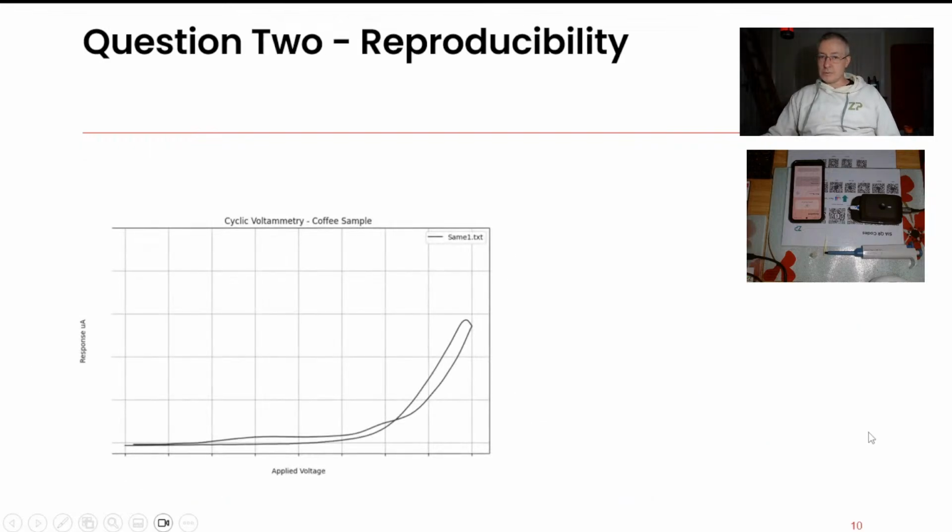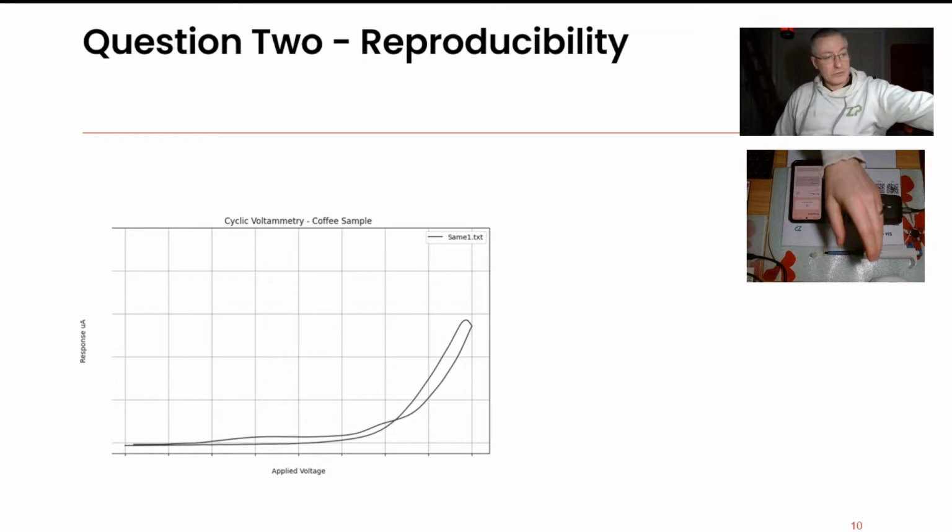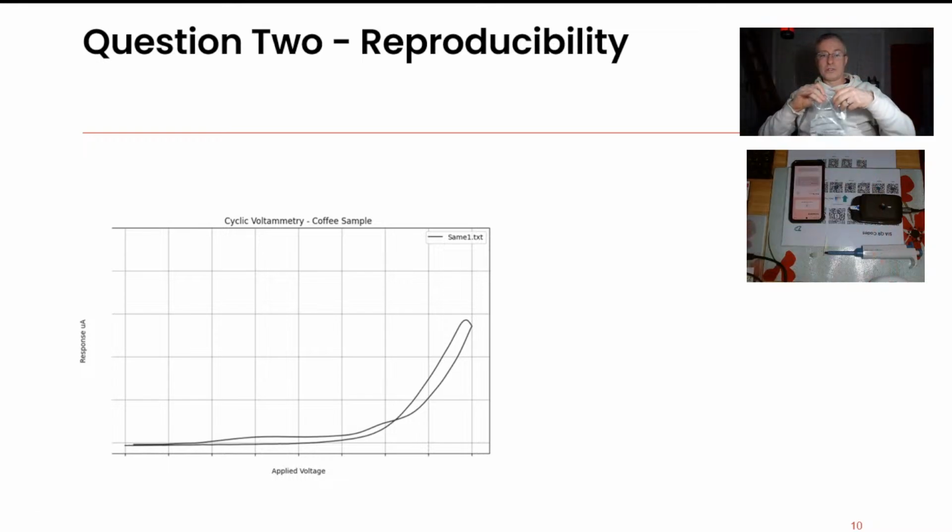Now, I'm going to answer reproducibility here. When we're making these screen printed electrodes at ZP, we're definitely working on ensuring reproducibility. So when somebody says, I'm not getting reproducibility, of course I'll take that and address that.